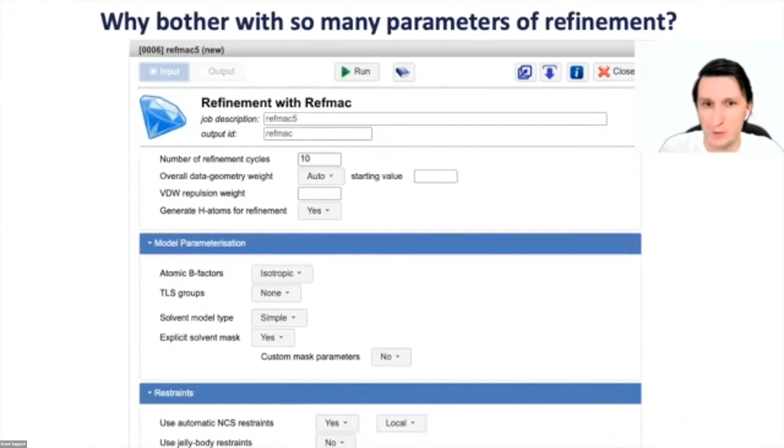After the molecular replacement solution, the majority of the atoms will not sit in their right places, and we need to move them first. Also, there could be missing parts of the structure. So only later, when 100% of residues are built and put in place, we can do fine-tuning, like anisotropic B factors modeling. This could be confusing for novice users. Can we help somehow? Yes.